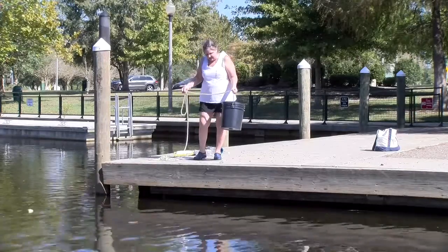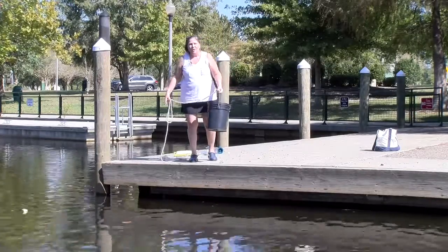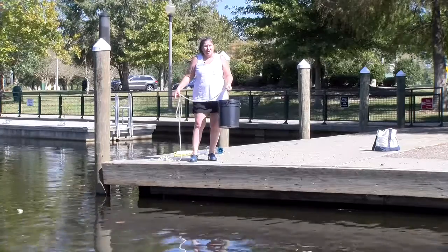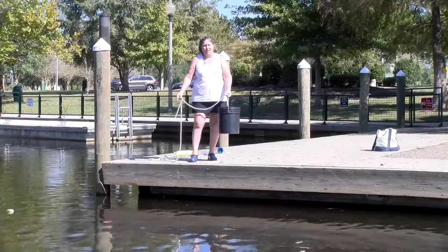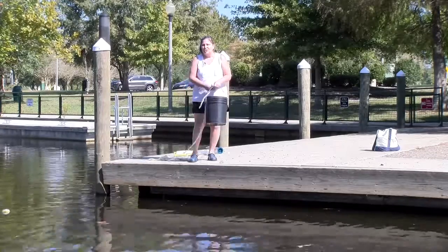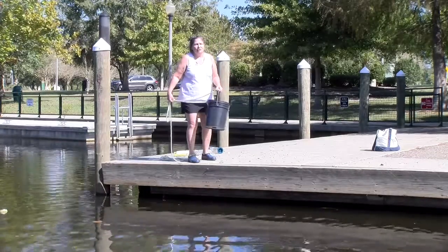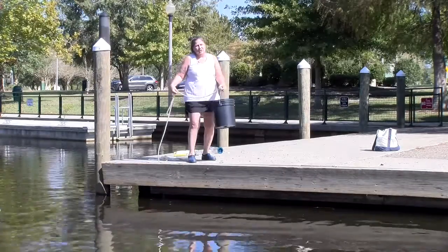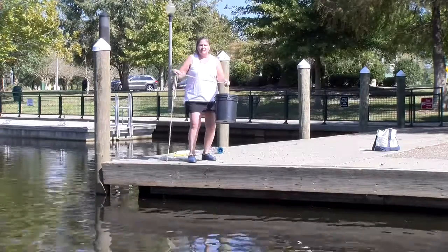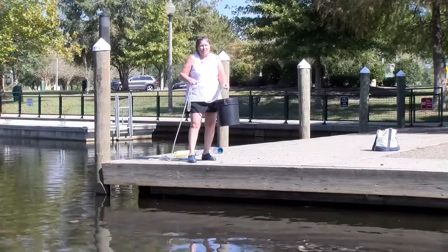So the first thing is to make sure, whether you're standing on a pier or on the side of a lake or a river, that your footing is stable so that you don't fall head over heels. So you'll bend your knees a lot in order to take the water sample.